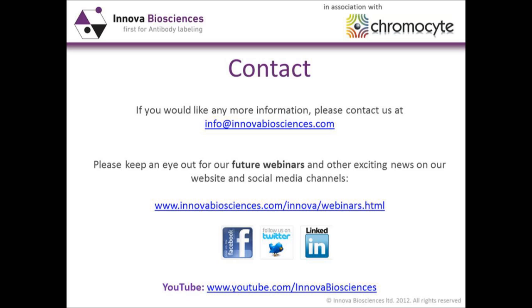Okay, thanks, Andy. We have a question relating to whether or how flow cytometry can be used for measuring apoptosis. Well, there are a number of ways for measuring apoptosis, and if you are interested in apoptosis, what you really need to do is use a number of different techniques.